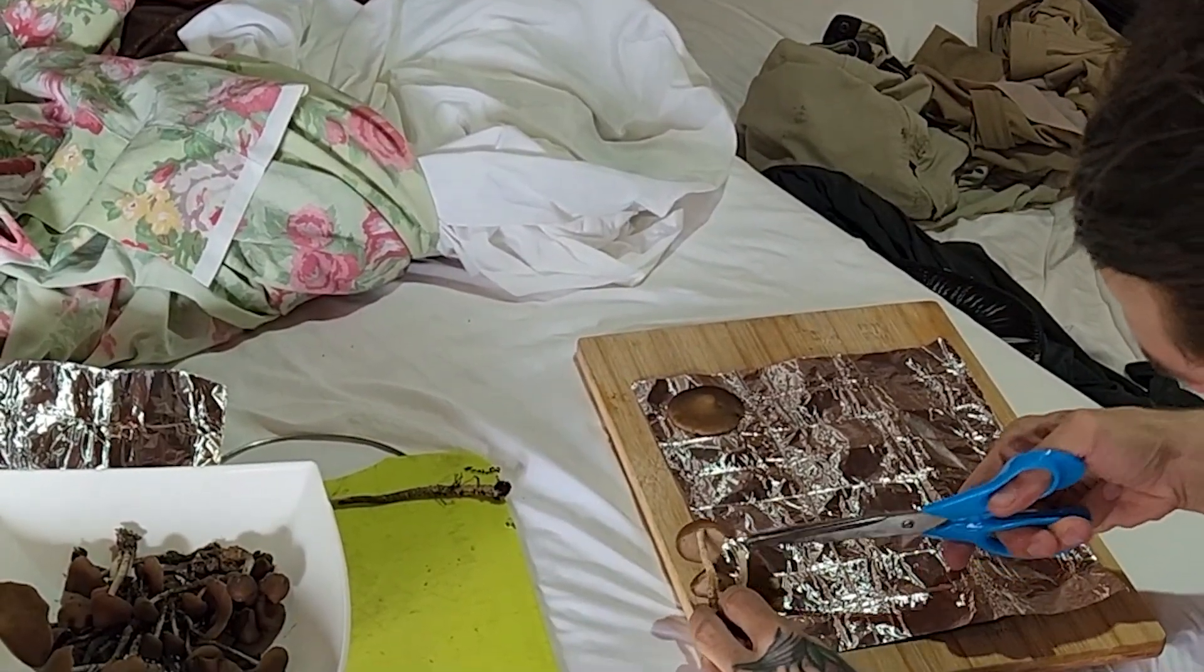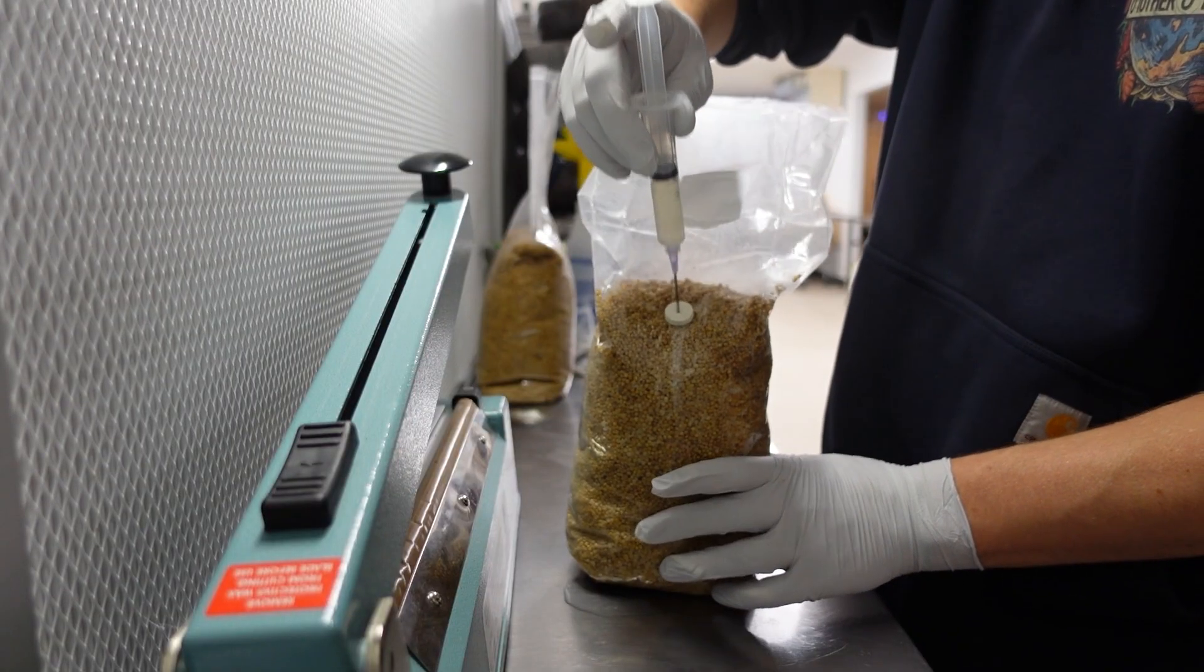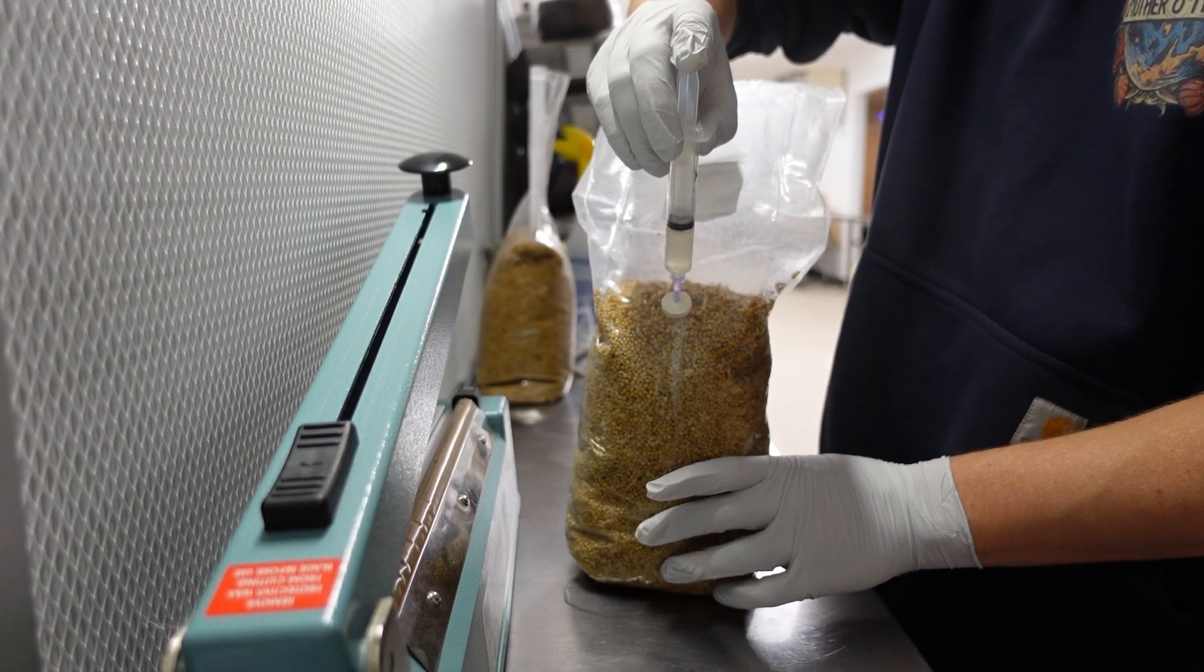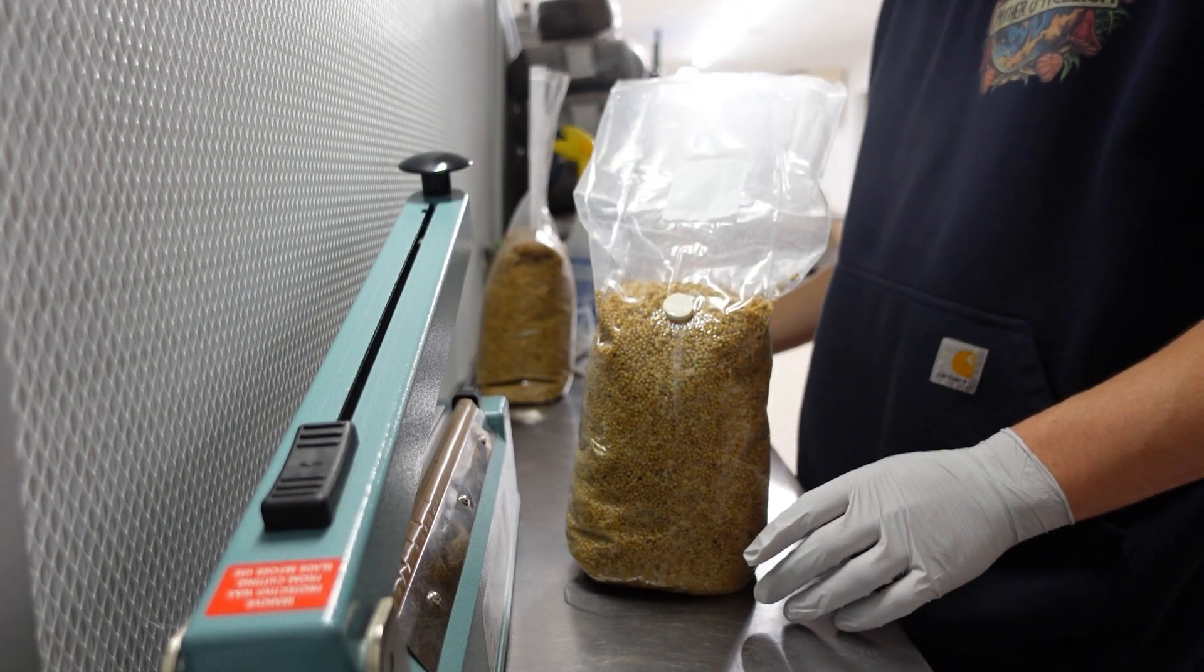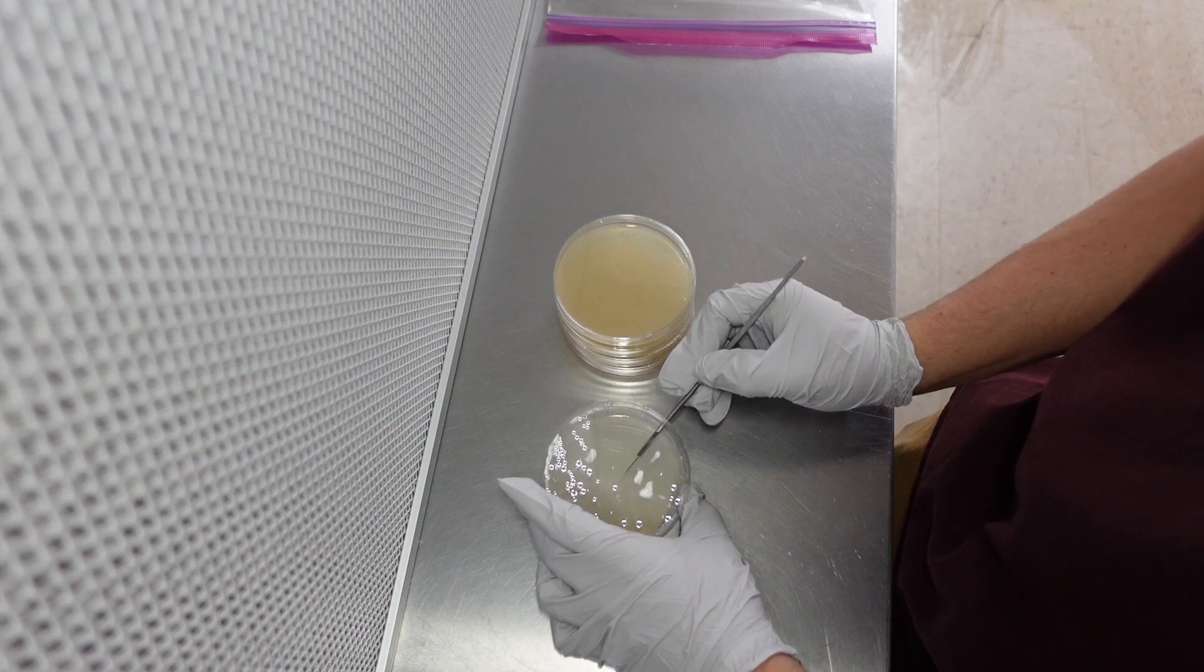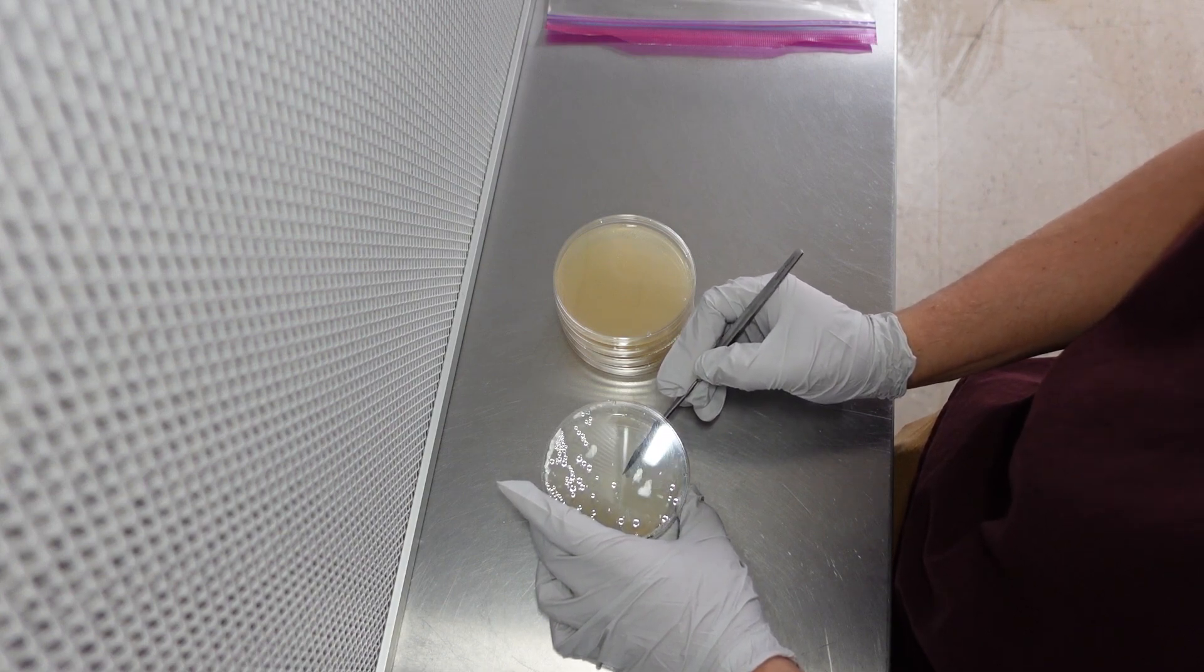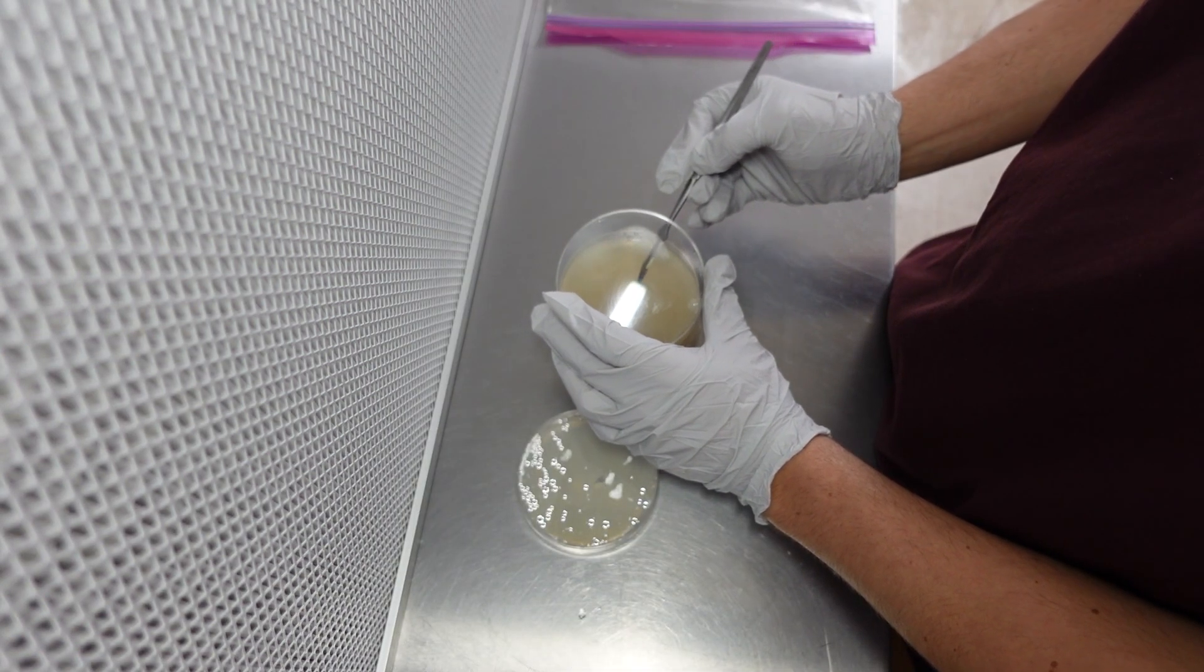If you have a spore syringe, you can skip the next step and inoculate the spore solution straight into sterilized grain. This tends to work well if the spore syringe is high quality and free of contamination, but it is always a good idea to plate out the spores first if you have the time and supplies available. By plating the spores before inoculating grain, you can isolate subcultures and ensure they are free of contamination.